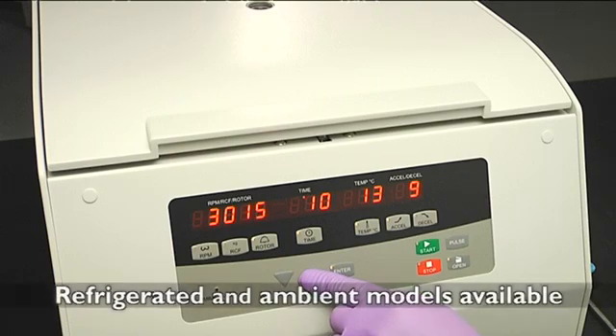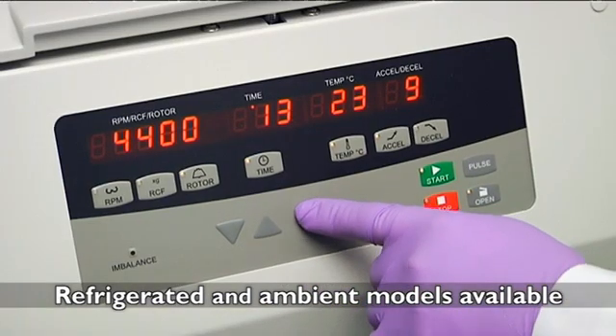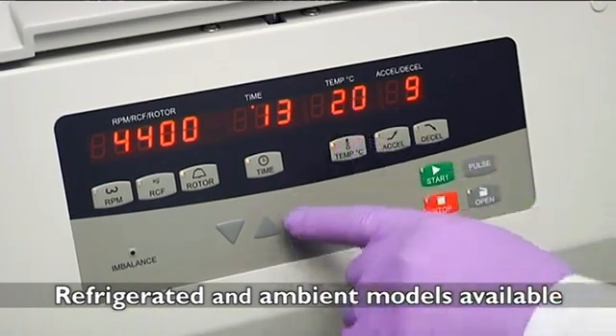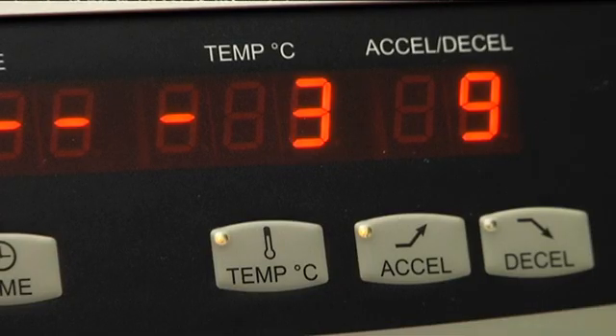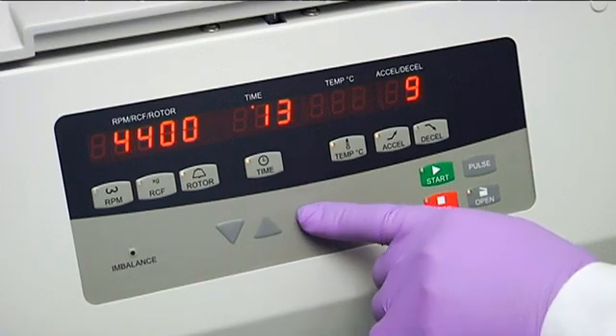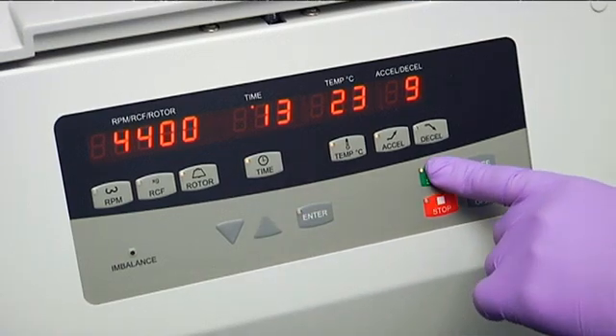And performance doesn't just relate to our rotors. In our refrigerated models, the chamber can be cooled from room temperature to 4 degrees Celsius in less than 10 minutes. Faster setup and higher speeds equals less time waiting on your centrifuge, so you can move on to other important tasks.